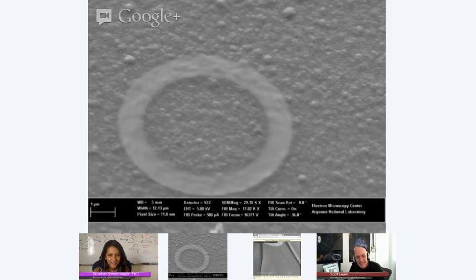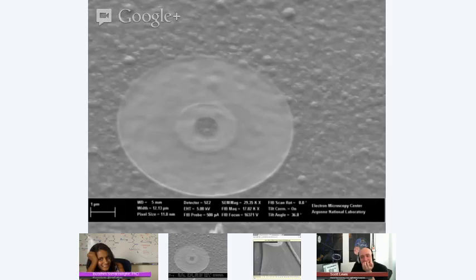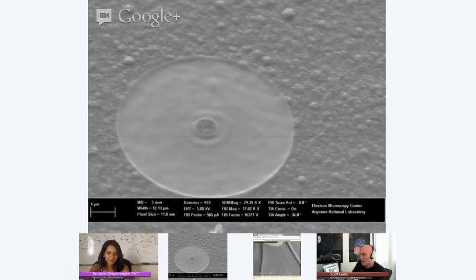And so I'm selectively targeting a very small area that's 1 micron, and I want to make a little point out of it because I want to study that. And so you see the removal of the diamond, of the ion beam. And then the tungsten seed layer underneath it, and then a silicon substrate. So what this allows us to do is find a very specific, site-specific area in your sample and be able to characterize that very small area of interest.